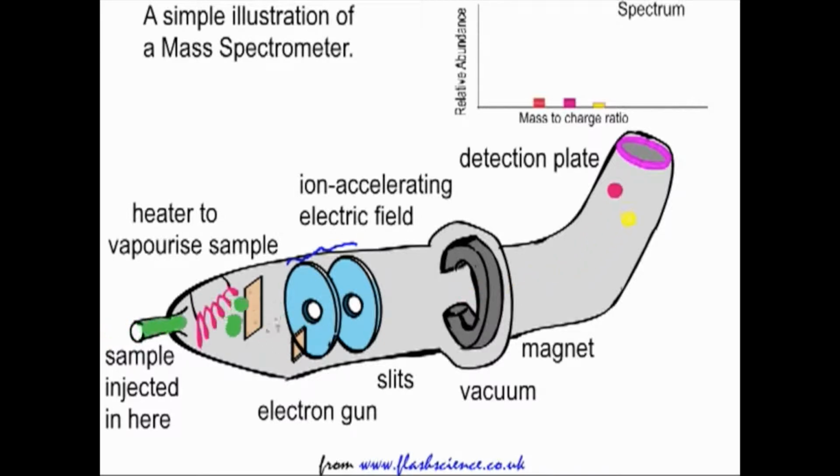After they are made into ions, they are sped up and put in a straight line. In this area, the ions are run through a magnetic field and an electric field. This is done so that the ions that are not traveling at exactly the preferred speed are brought out of line by being too attracted to either the magnetic force or the electric force. This process is referred to as the velocity selector.